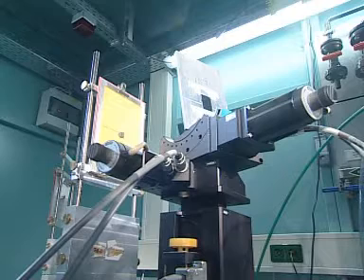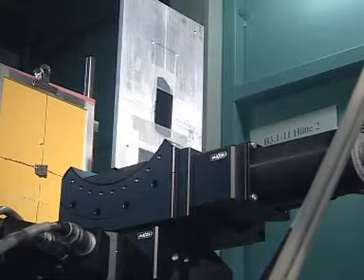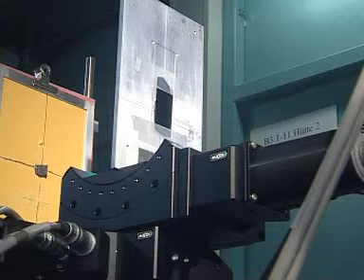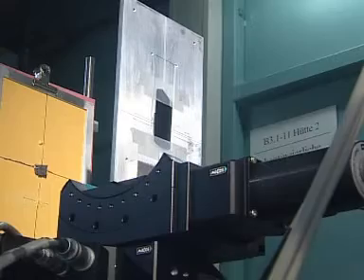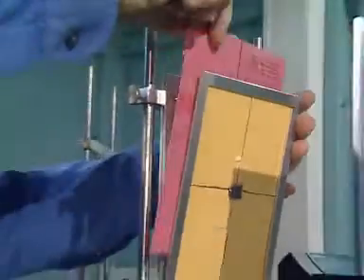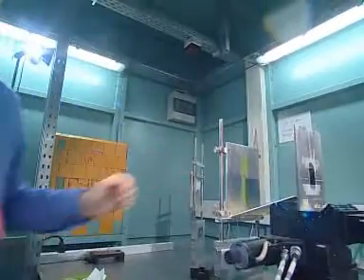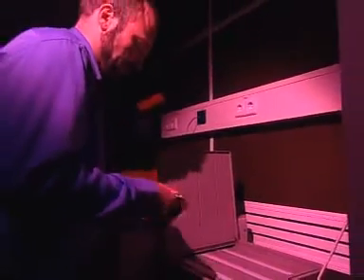However, it is not only the diffraction pattern which provides information about a crystal. Also, the internal structure of each single diffraction reflection is of special interest. High-resolution X-ray films are needed to record the fine structure of the diffraction reflection. After brief exposure, the film can be taken out and developed.